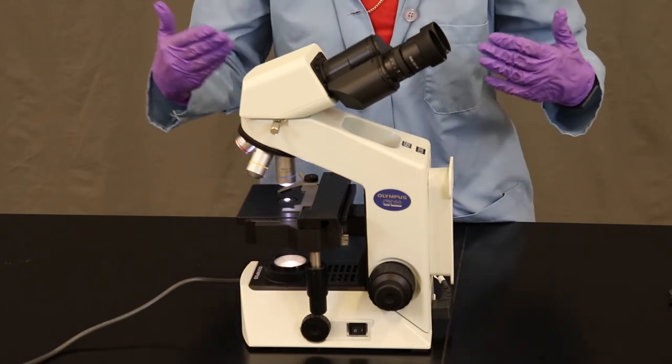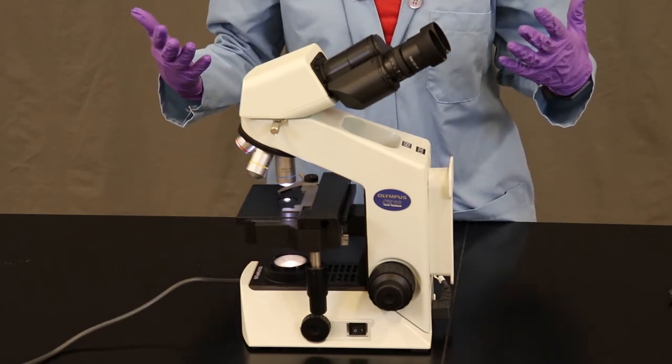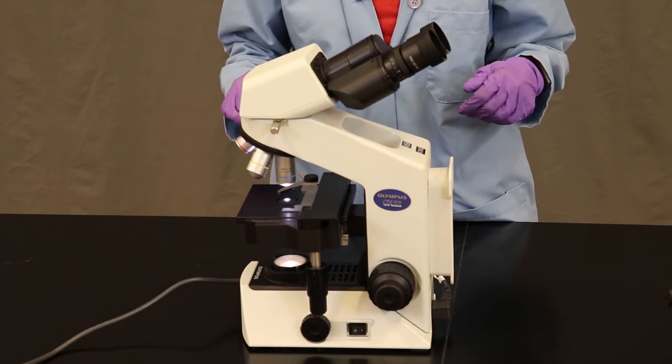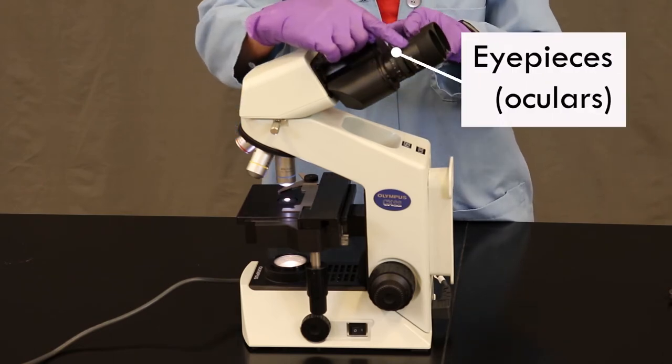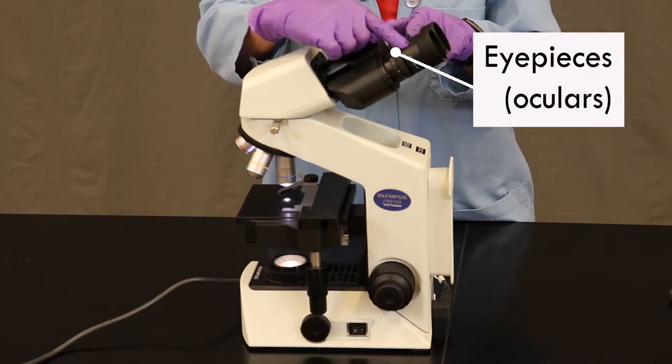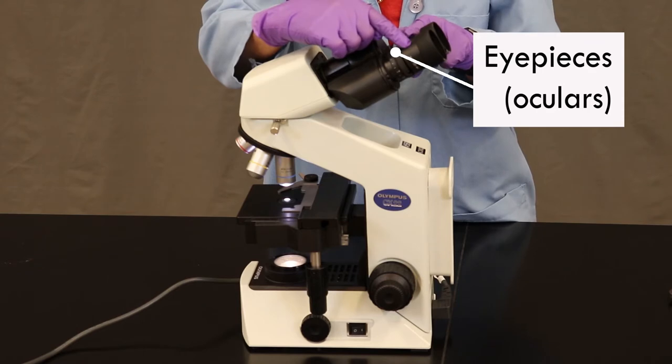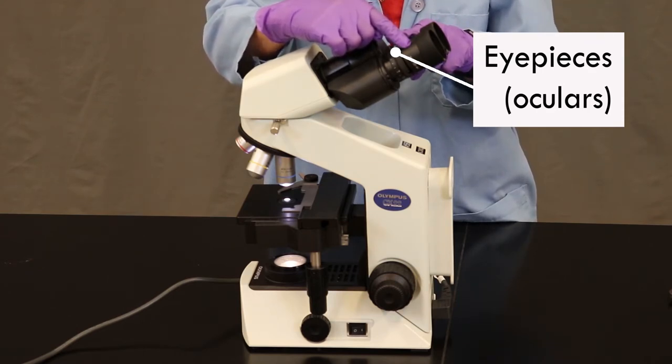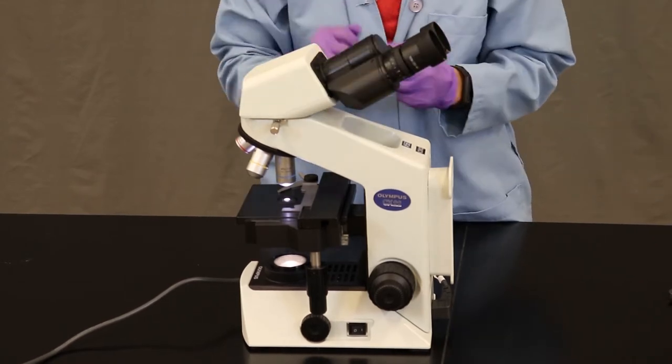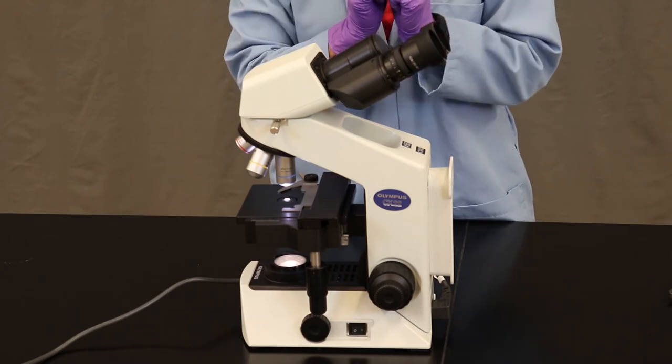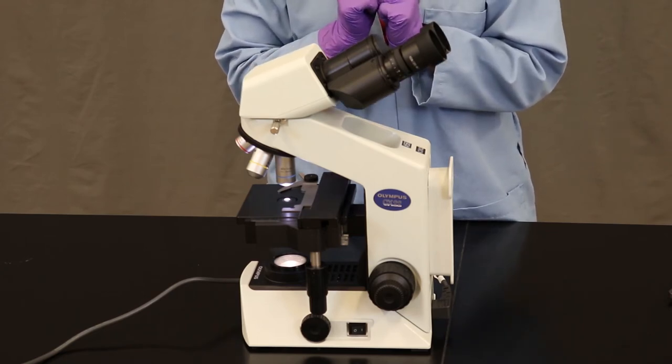The parts of this microscope all have names. So one of your questions asks you to label some of the parts. Why don't we go over some of them? There are the eyepieces and this is where you put your eyes. They are basically like when you look through a pair of binoculars. So if we could take all of this off, it would be like a pair of binoculars and each eyepiece magnifies what we're looking at 10 times.